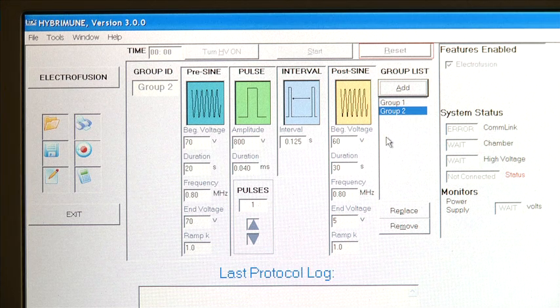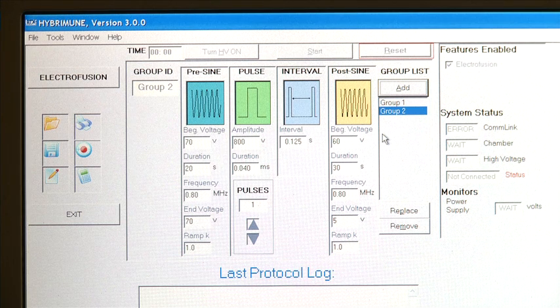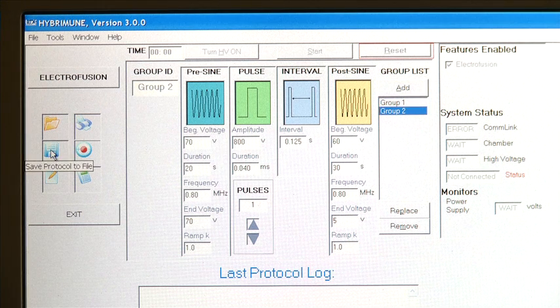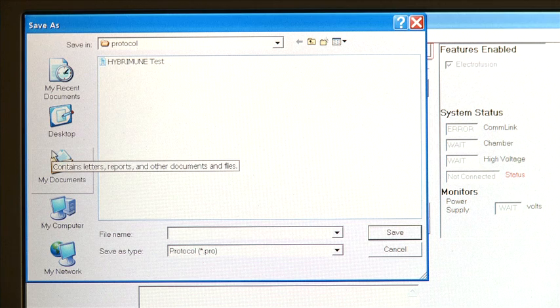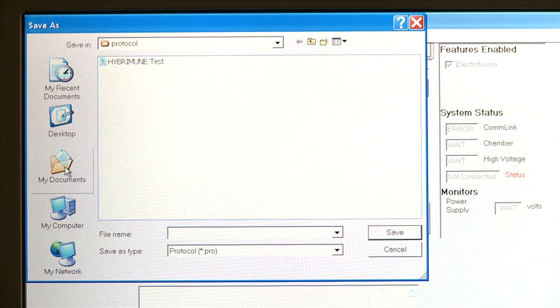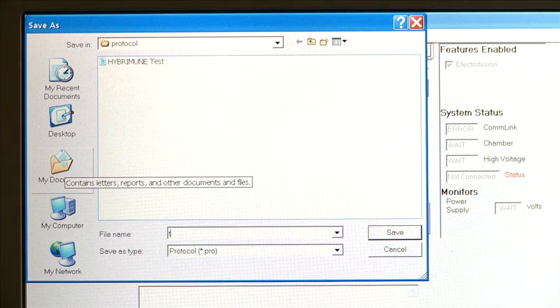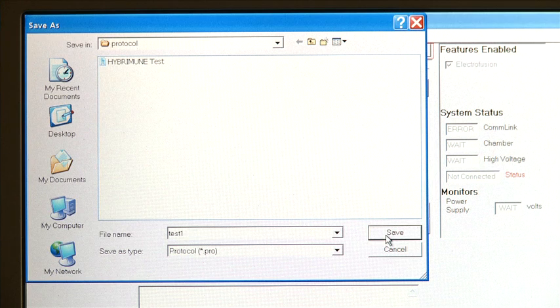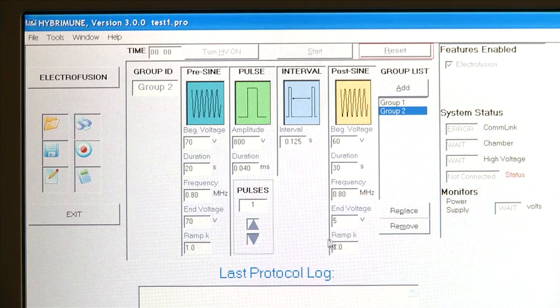The protocol works on a stack: it will execute Group 1 first, then Group 2. To save the protocol, click on the disk icon and the Save As window will pop up, prompting you to name the protocol and save it in the protocol folder. Then click Save.